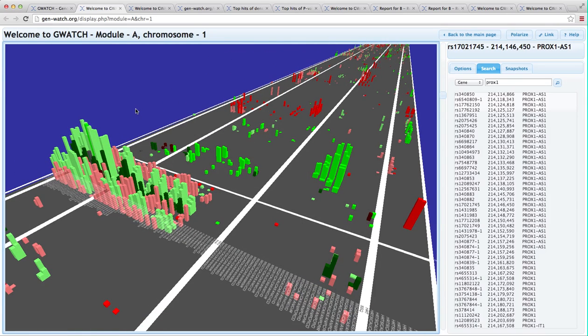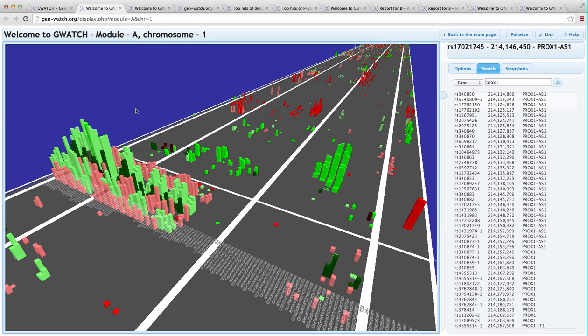Think of this as you have loaded your Alzheimer's dataset into GWATCH and then go to a conference. Somebody presents a report on a functional connection of a new protein with Alzheimer's disease. You open GWATCH, search for the gene, and see if your Alzheimer's dataset shows any genetic association before the person finishes his talk.